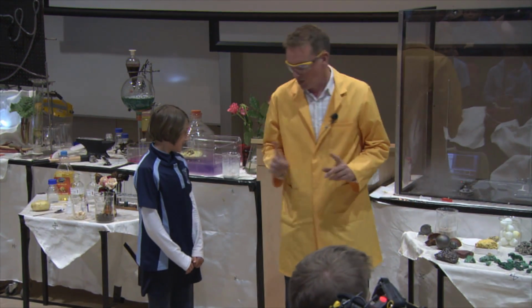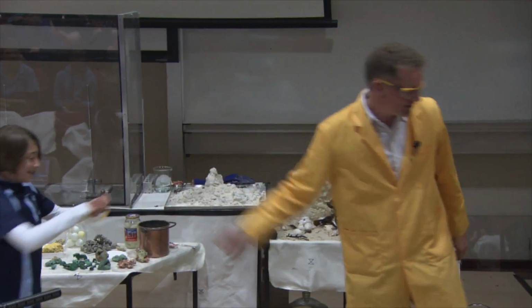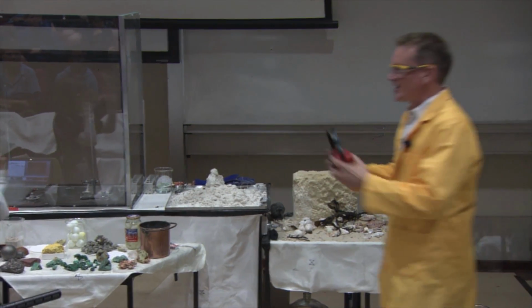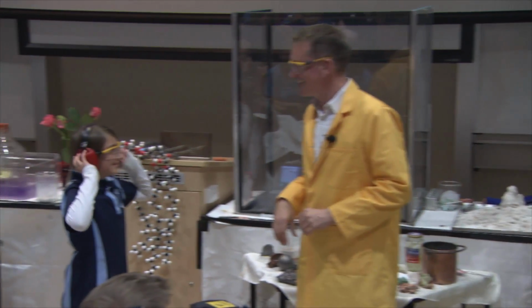Okay, right. Now, what you need to do is, first of all, you need to put on your safety spectacles. You can have the same ones as me, nice yellow ones. And then you need to put on these ear defenders, so then we can talk about her and she won't hear. Okay? No, sorry, just kidding. I'm going to put some on as well, actually.